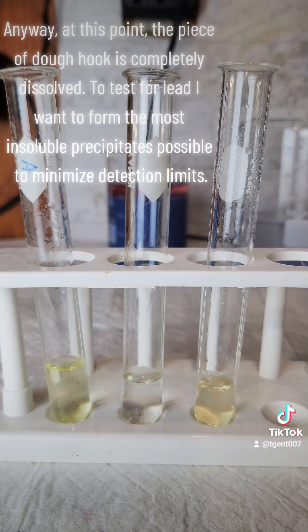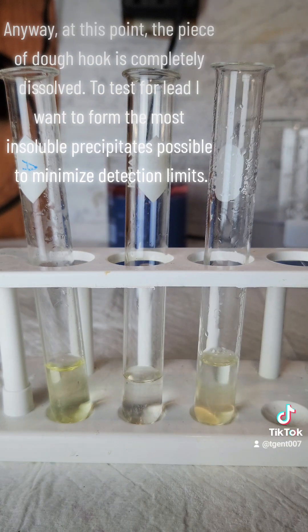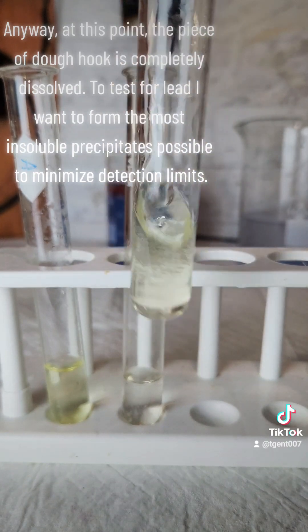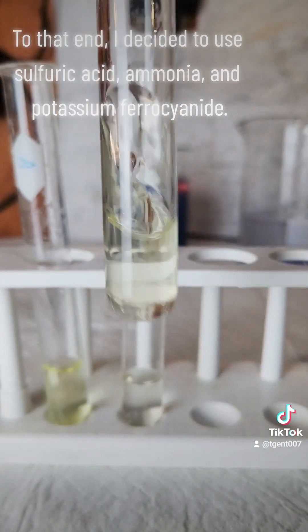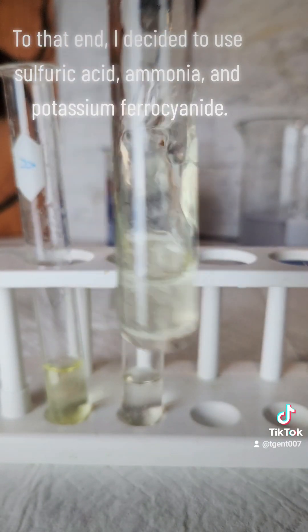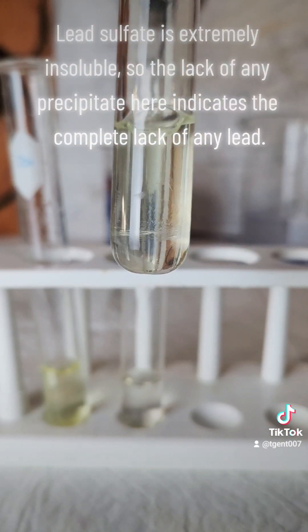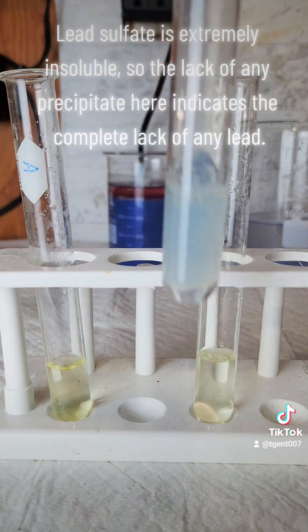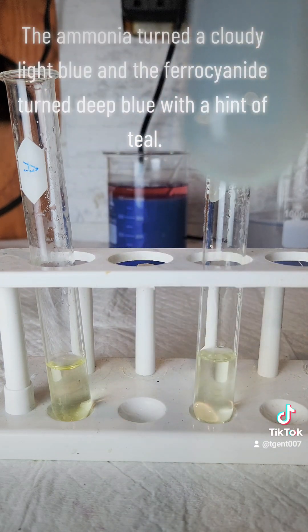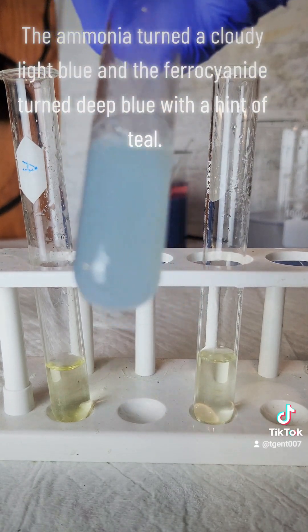At this point, the piece of dough hook is completely dissolved. To test for lead, I want to form the most insoluble precipitates possible to minimize detection limits. To that end, I decided to use sulfuric acid, ammonia, and potassium ferrocyanide. Lead sulfate is extremely insoluble, so the lack of any precipitate here indicates the complete lack of any lead. The ammonia turned a cloudy light blue and the ferrocyanide turned deep blue with a hint of teal.